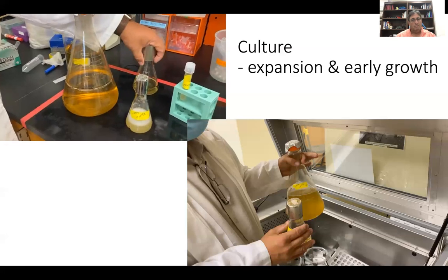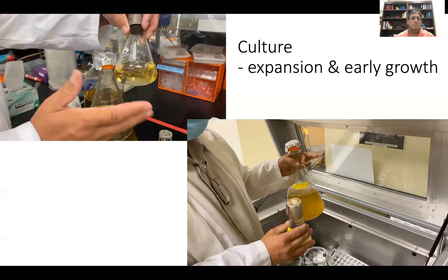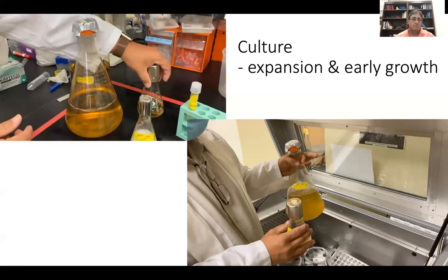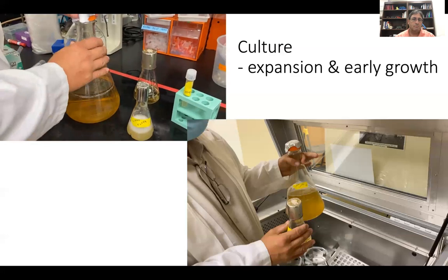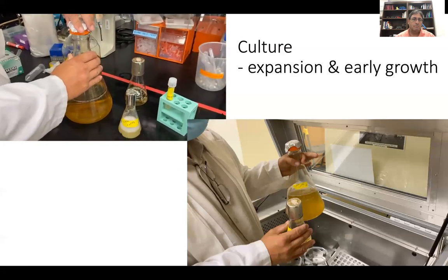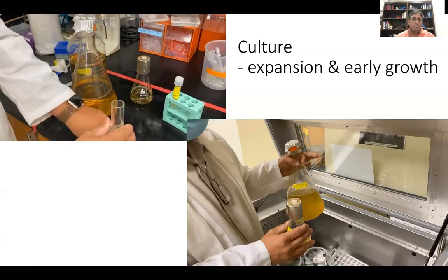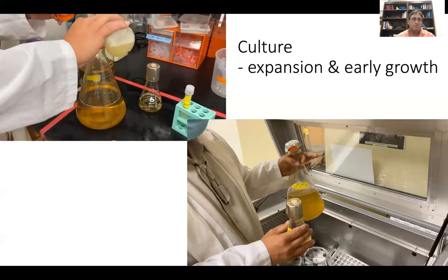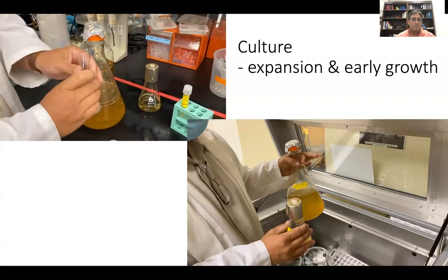100 ml in a 250 ml flask is certainly good. Notice this one doesn't have the baffles. Again, that'll grow just fine. You have to use what you have available to you. So now in this case, we just simply transfer 20 ml from here. There.